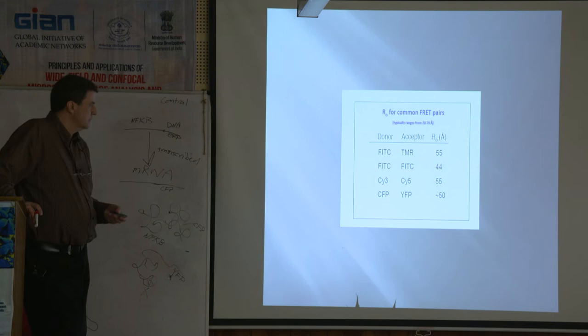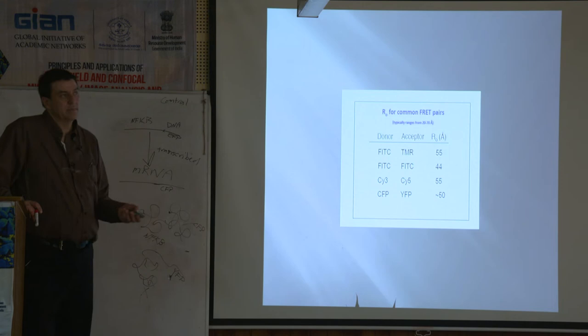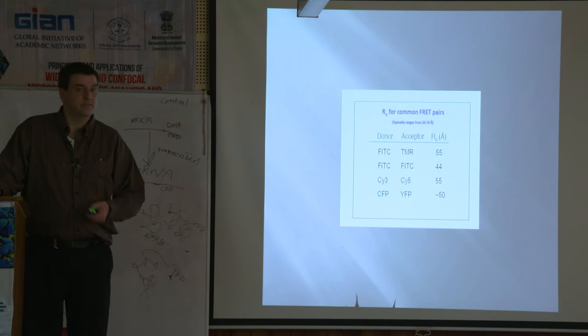Okay, again, a couple of the different kinds of pairs for FRET. And again, if they're super close, it'll work. If they're not super close, it'll never work. So I guess step A would be, like we talked about, if two proteins co-localize, then it might be worth doing FRET. If two proteins don't co-localize, why would you even bother to do FRET, right? I mean, why bother?